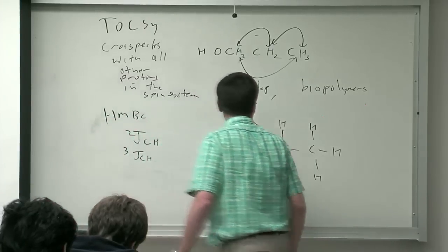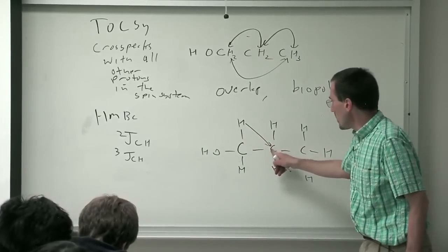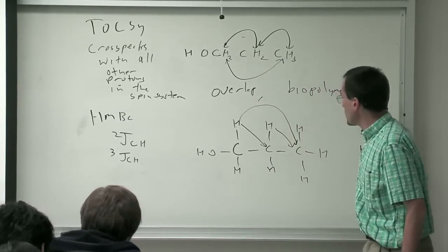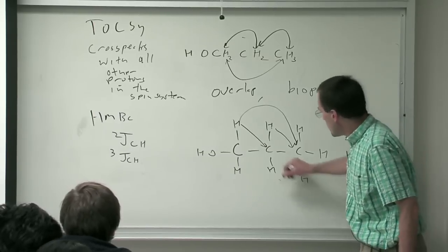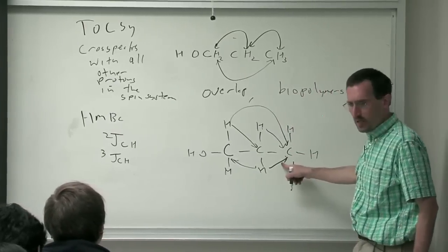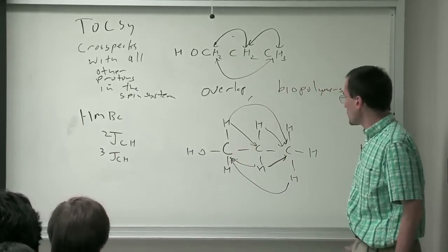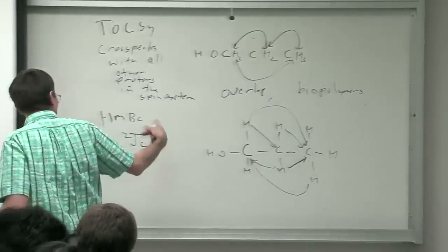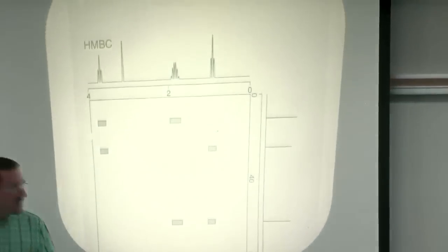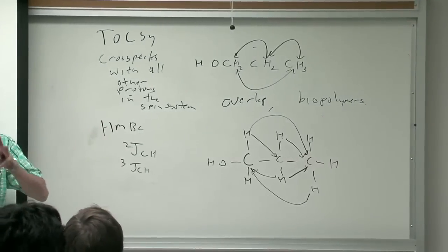Not always in a predictable or guaranteed fashion. So in other words, this hydrogen will be coupling with this carbon. This hydrogen will be coupling with this carbon. This hydrogen will also be coupling with this carbon. This hydrogen will also be coupling with that carbon. So you're getting this tremendous amount, and if the OH is exchanging rapidly, it won't be coupling with any of them. And again, right now, it's too overwhelming for you at this point to just throw all these spectra at you and say use them.